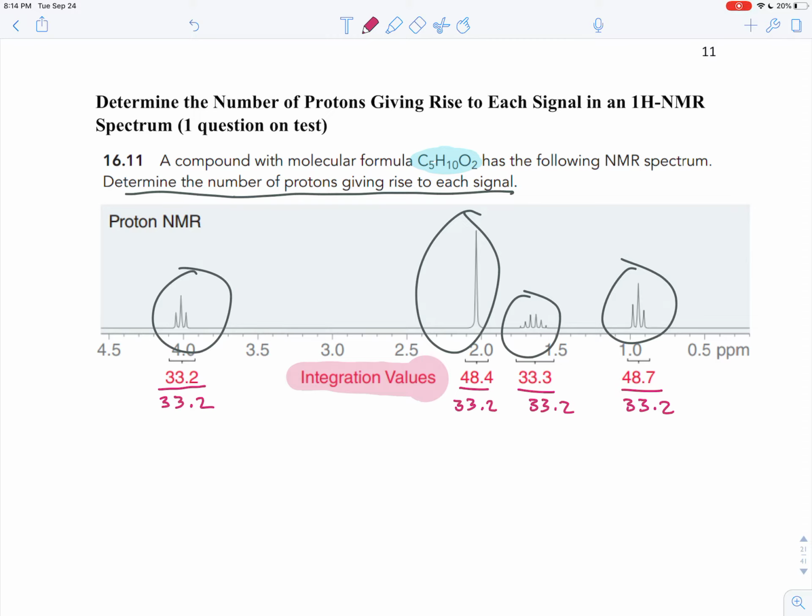All right, now with these, for me, you will either want to round to a whole number or to a 0.5, whichever one's closer. So here, this would be 1. This would be rounded to 1.5. That's what that's closest to. This is 1, and this would be rounded to 1.5. That's what that's closest to.